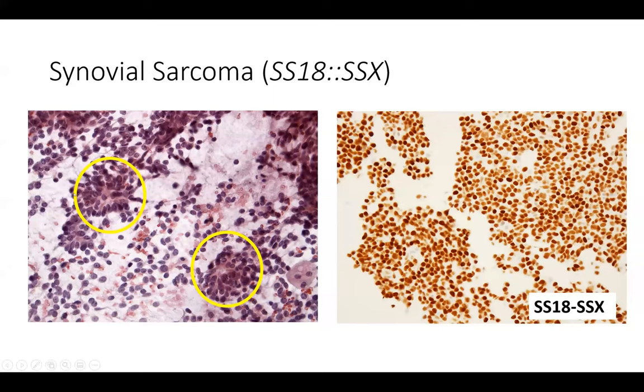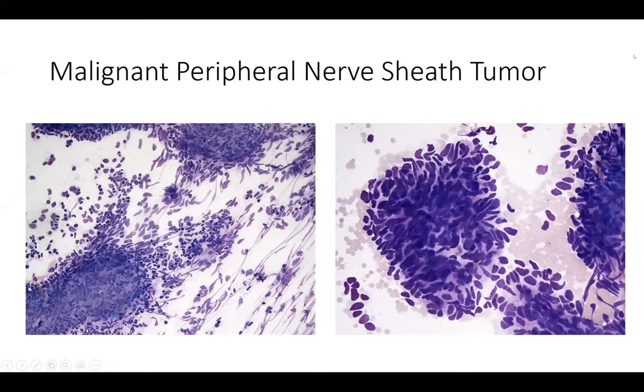Here you can see, this is just an example of a biphasic synovial sarcoma. So those will still have the same spindle cell population with the shaggy fragments and the nuclei investing the spaces between the fragments. But you can see here these little areas where there's nuclear palisading and acinar formation. And that's the epithelial differentiation in a biphasic synovial sarcoma.